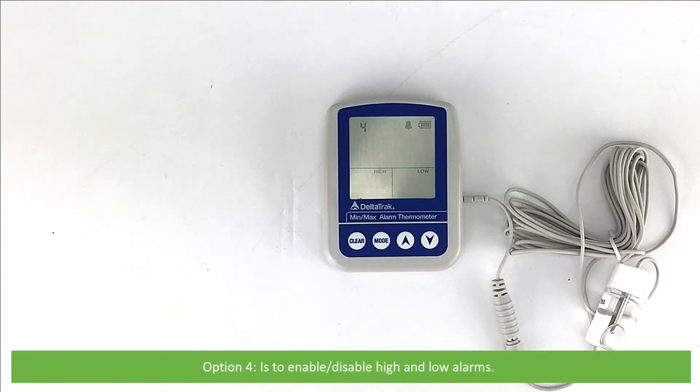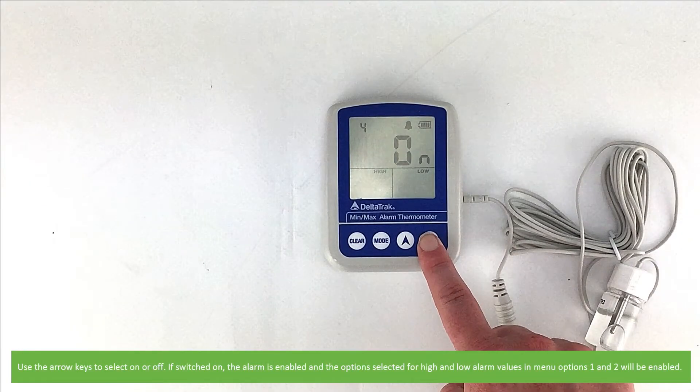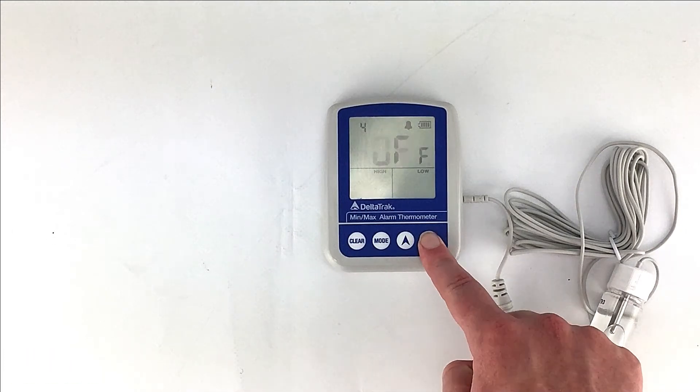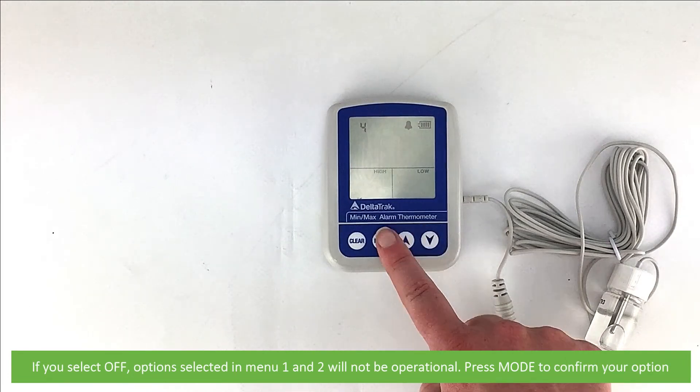Option 4 is to enable high and low alarms. Use the arrow keys to select on or off. If switched on, the alarm is enabled and the options selected for high and low values in menu Options 1 and 2 will be enabled. If you select off, Options 1 and 2 will not be operational. Press Mode to confirm.